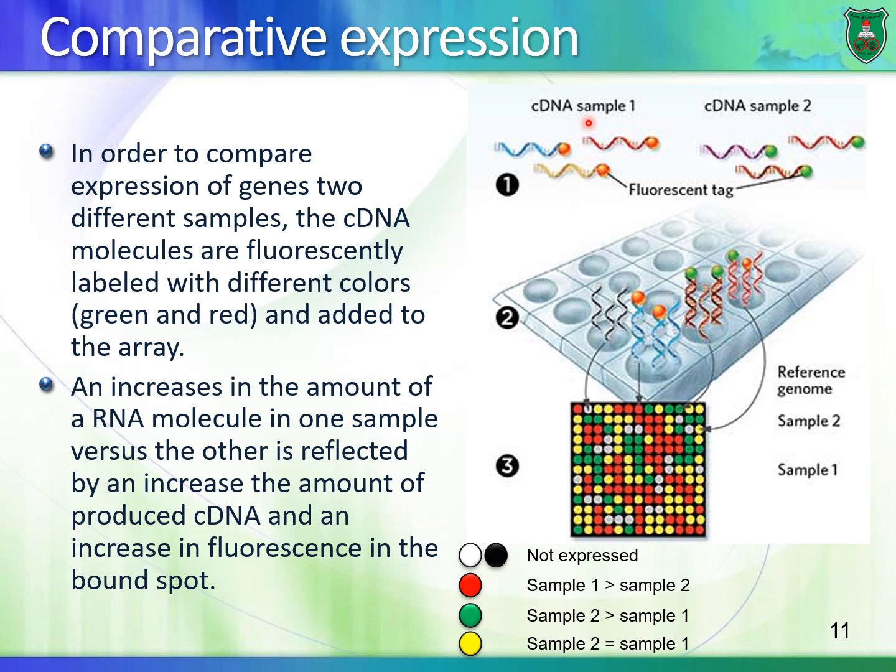Let's say the opposite happens. That is, you have expression of gene in healthy cells, but then when they are exposed to a drug or they become cancerous, the expression of this particular gene is decreased, meaning that you will have more red fluorescence than green fluorescence, and you will have on any particular spot more red fluorescence emitted, okay, than green fluorescence. So let's say that the gene is not expressed whatsoever in sample 1 or sample 2. It means that there will be no signal appearing whatsoever.